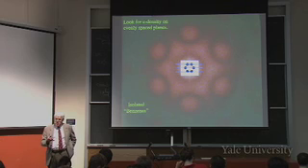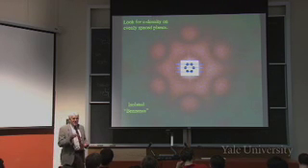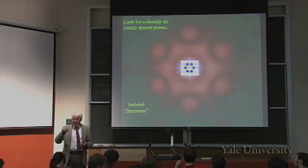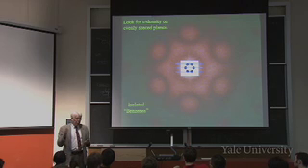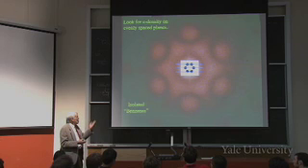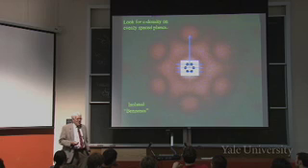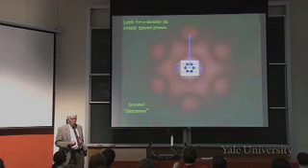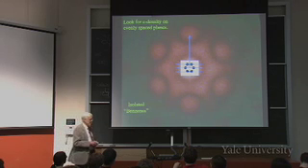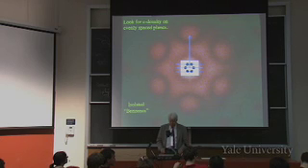So they're evenly spaced, 3 of them, and all the electrons fall on or near them. Notice they don't have to fall exactly on, because if they're displaced a little bit, the phase of the wave will change a little bit compared to the others, but only a little bit. So it just has to be near, not exactly on. Okay, so there we have it. Now, that means that you'll get scattering in that direction where they will reinforce one another. Right? Let's go back to the display we were looking at before.